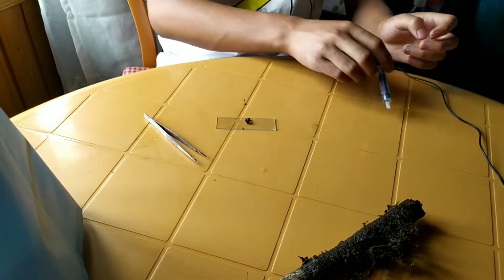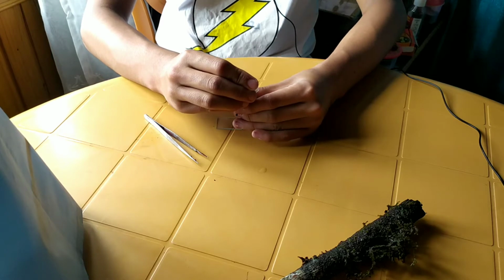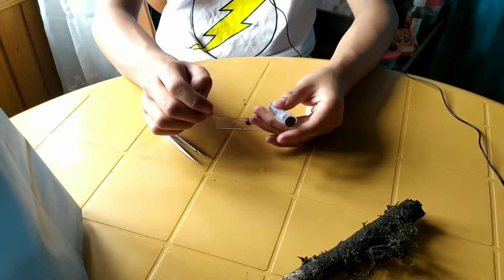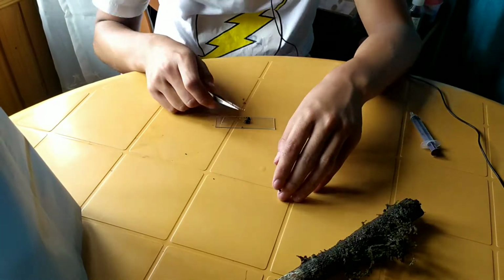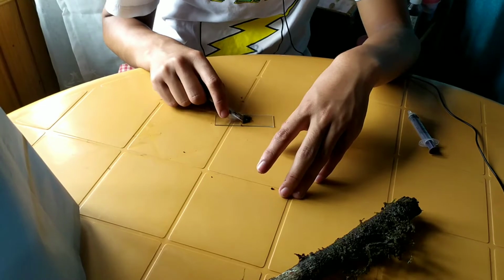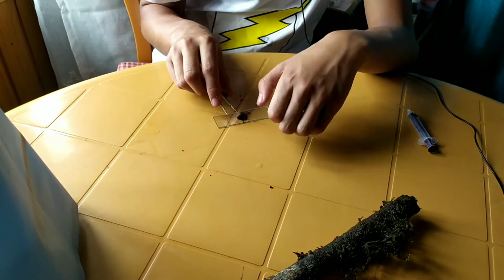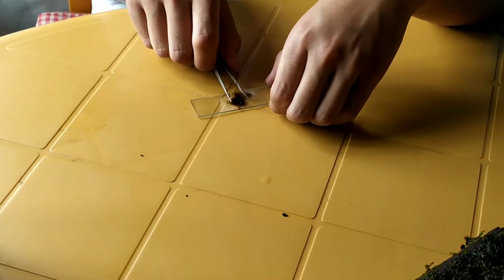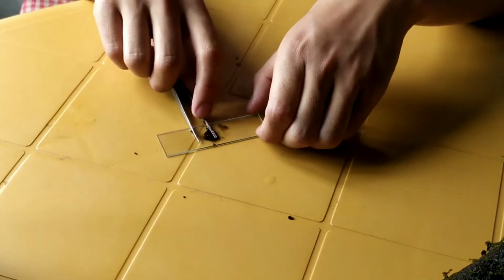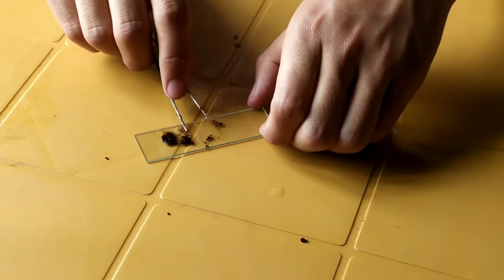As you can see over here, I'm adding a few drops of water. This is actually filtered water, so I don't get any contamination in it. Okay, I've added a few drops of water and I'm going to place these black wood particles at one side.